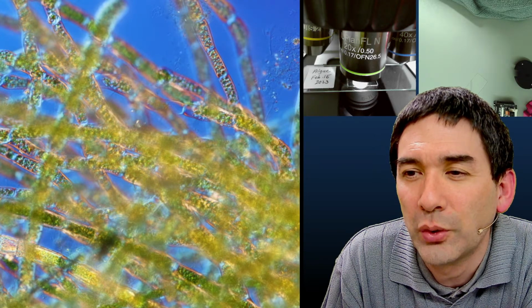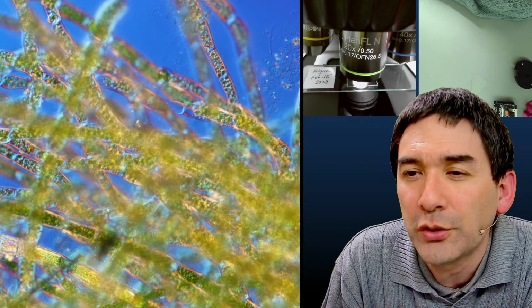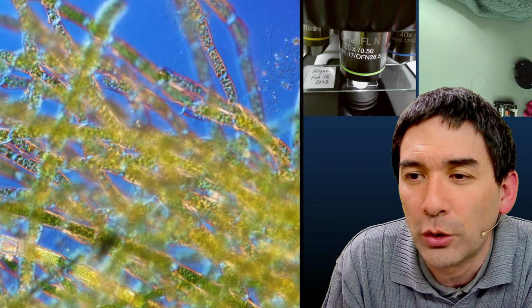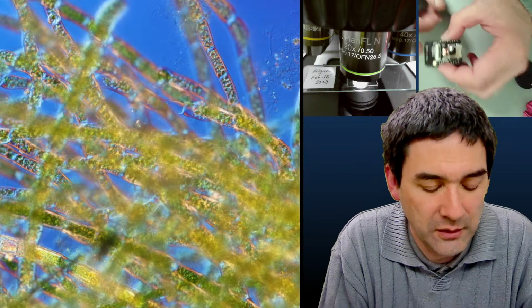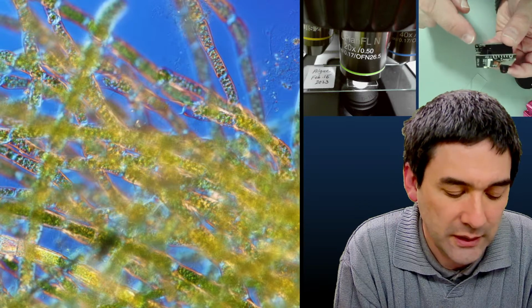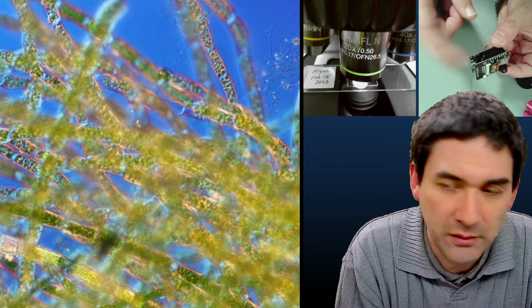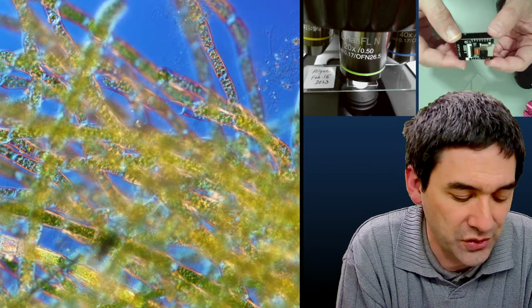I wonder if I could join. I'm only 11 years old. The camera module is quite affordable. It costs about $20 and will be a little fun project to customize the camera for microscopy. I think $20 is actually quite expensive, because I know that at least on AliExpress, the top part costs about $5 or $6, and I think the bottom part, which might not be needed if you're somehow able to directly connect the power supply, costs almost the same. So I think you should be able to get everything for around $10.